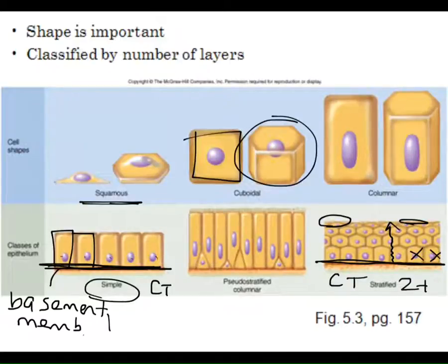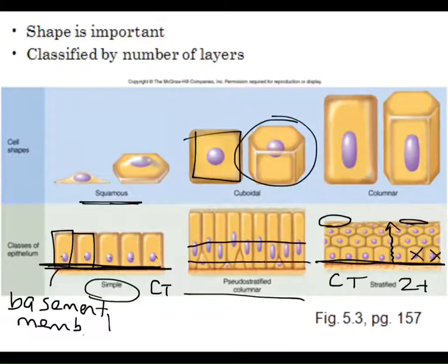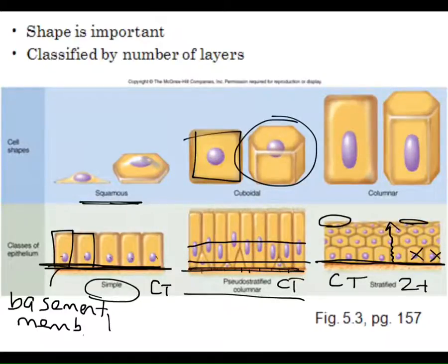There's another type called pseudo-stratified columnar — those words always go together. It's really a simple epithelium, but at first glance it looks like there are two rows of cells suggesting stratification. If you look more closely, every cell is in direct connection with the basement membrane, so it's really one layer of cells that appear jumbled. Most of these cells are primarily very tall, and this tissue is very unique and distinctive — once you see it, you'll have no trouble identifying it.